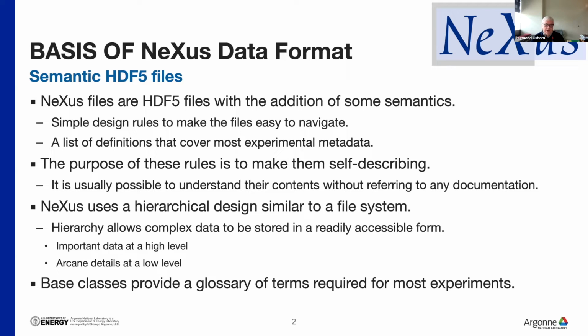And there are what are called base classes, which define glossaries of terms. So if you're going to store the temperature in a file, then it will tell you what sort of group to put that in and call it temperature. You don't call it temp, whatever. Okay.